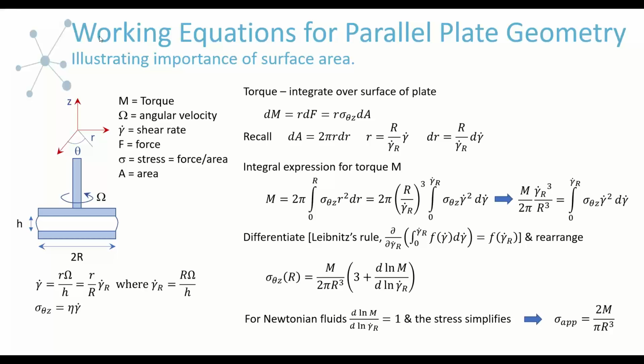Just like we have working equations for our microfluidic flow channels to convert all of the parameters to the viscosity, there are working equations for the rotational tools. When you look at how these equations come about, I think it really illustrates where this surface area comes in and how it relates to the viscous nature of the fluid and the stress that generates. Math really helps me understand things. If this is really not your thing, then you can skip it.